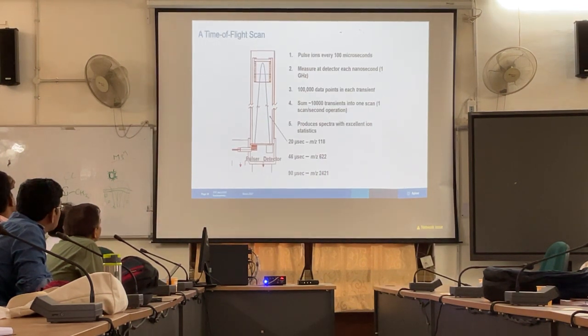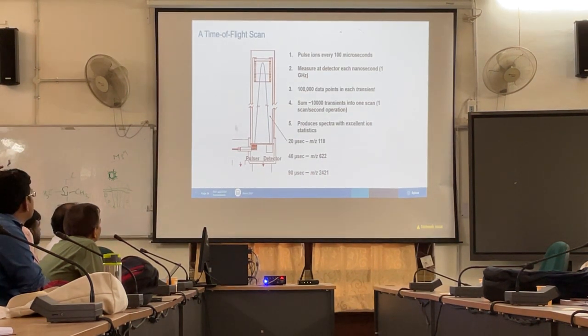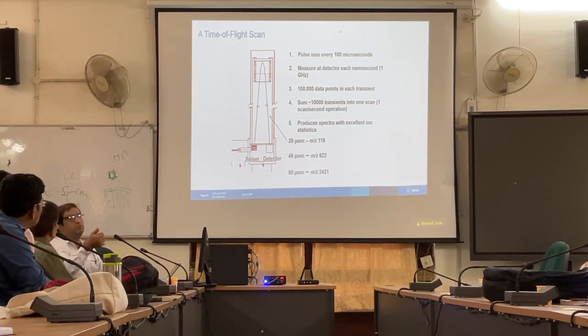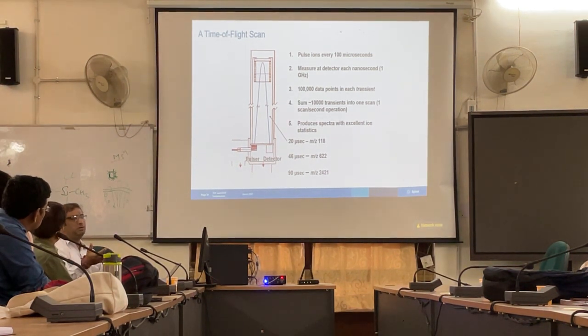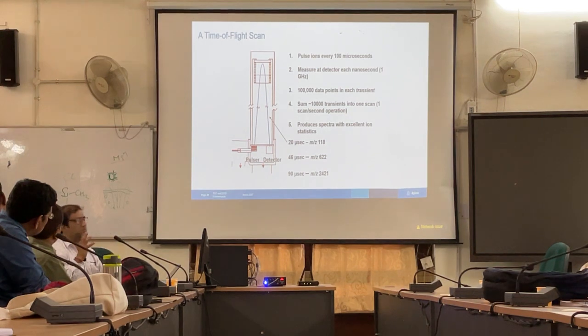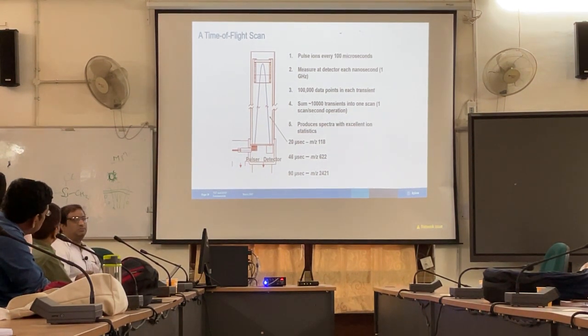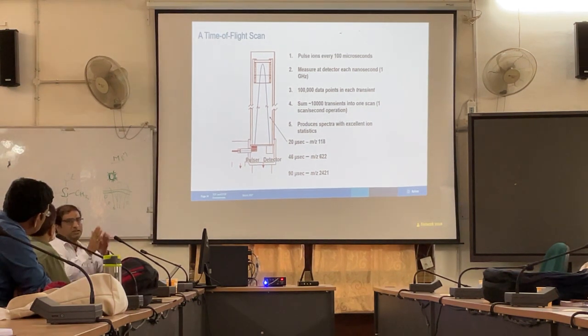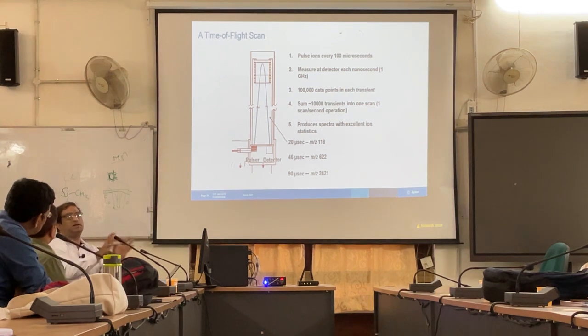And this is the part which we were discussing, like it takes 20 micros, and it is very important because, what I said earlier, the number of metabolites is important. You cannot do metabolomics with 20 analytes. You have to have a minimum of 2000 analytes. Now with 2000 analytes, any quadrupole based mass spec cannot analyze them. Or if you were to analyze them, you have to run maybe 120-minute chromatography to separate them and give them as a separate peak to the mass analyzer.